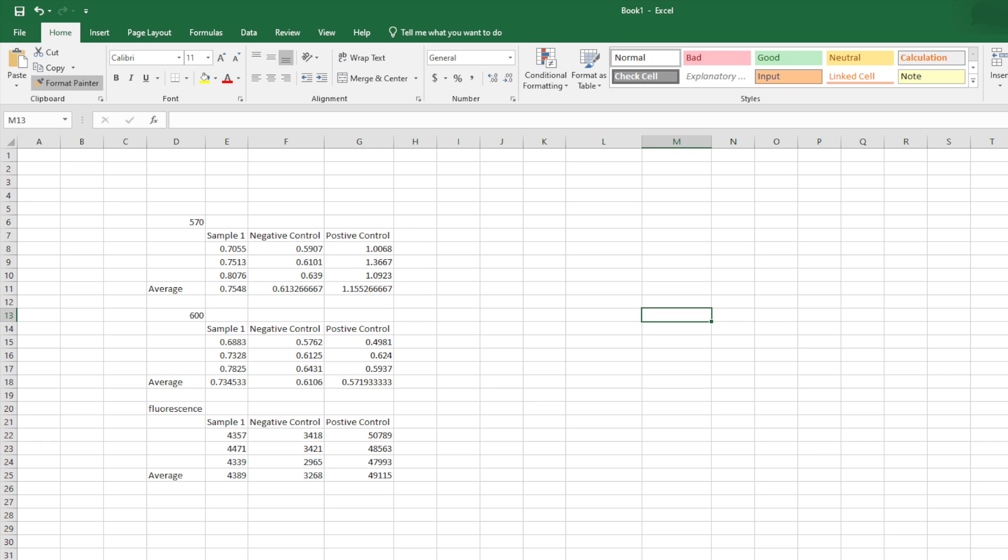We have sample one, negative control, positive control, and the average for all the biological replicants. And then 570 is your 570 nanometer read, 600, and then the fluorescence read.